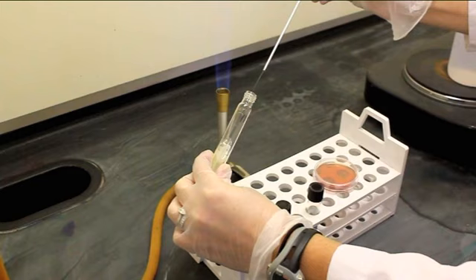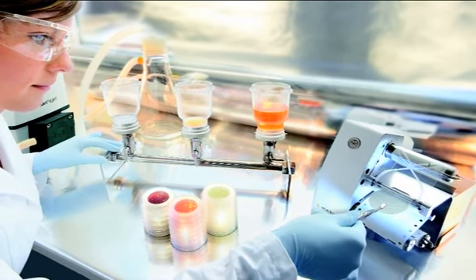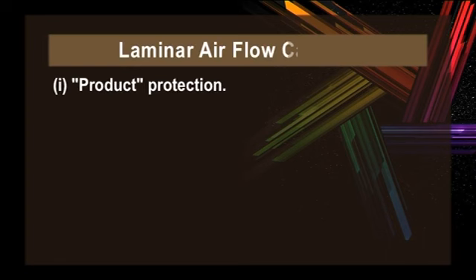In the laboratory, individual laminar airflow cabinets are commonly used for specialized work such as inoculation, culturing, and media transfer, which involves working or handling microbes, to eliminate airborne contamination that would otherwise interfere with work processes. There are 3 general areas in the field of microbiology related to processes where laminar flow can be applied. 1.